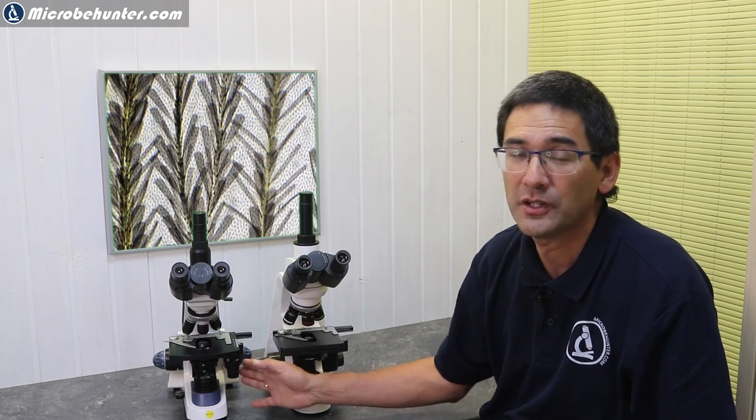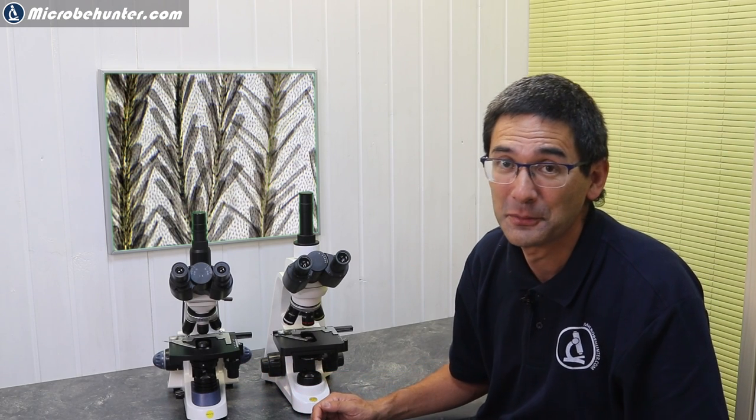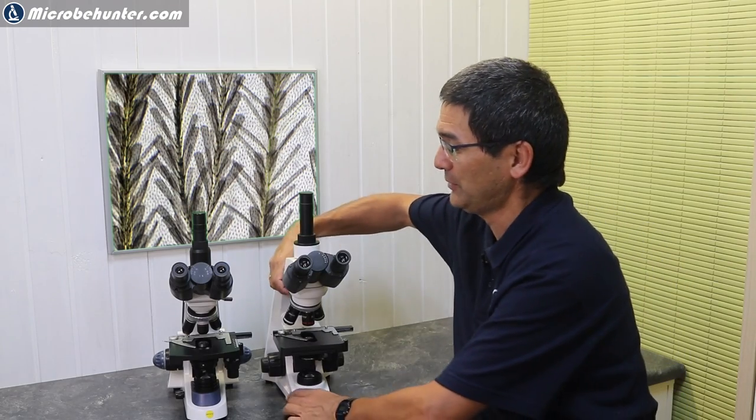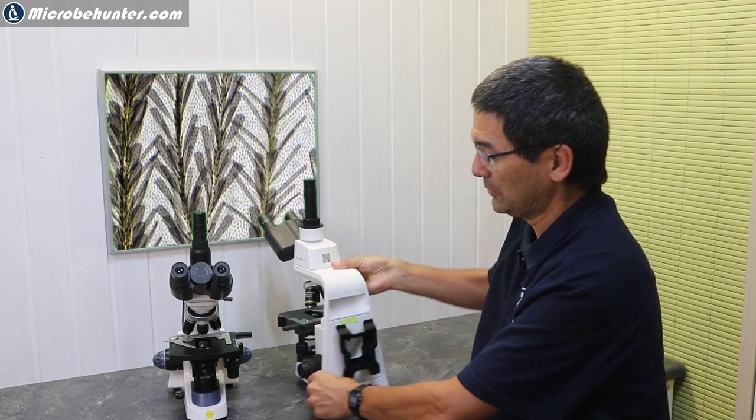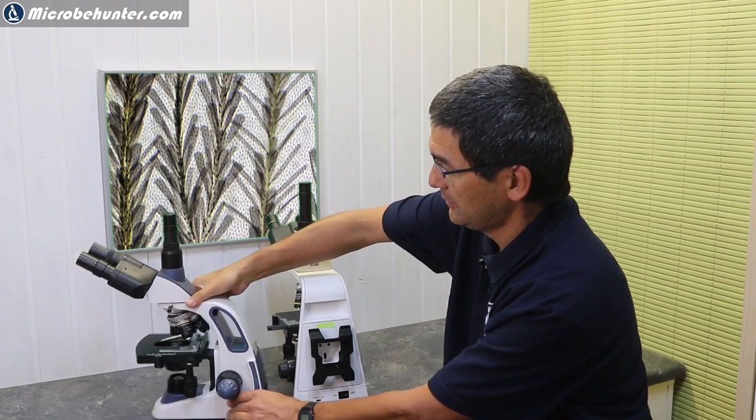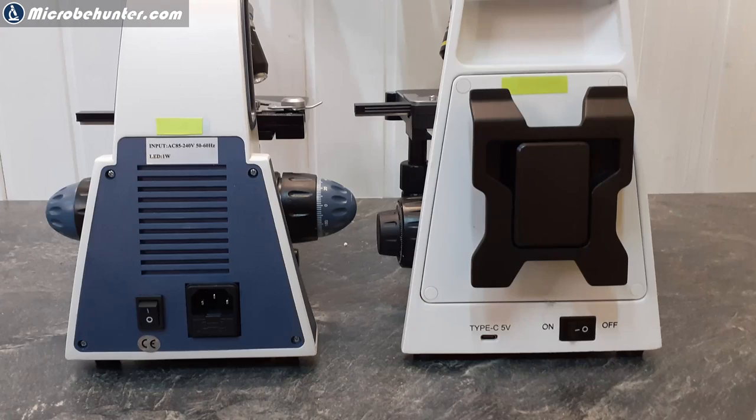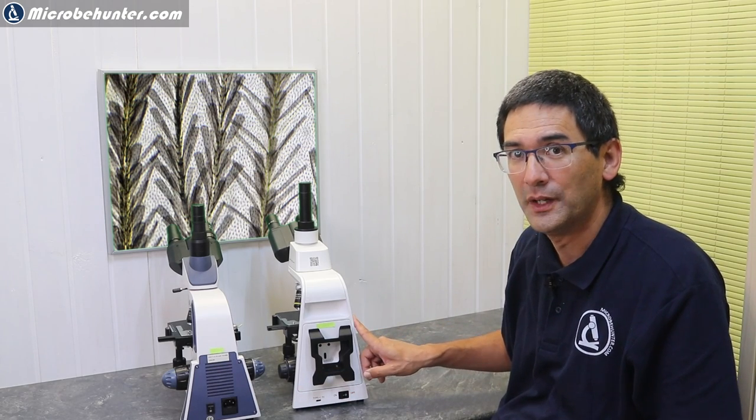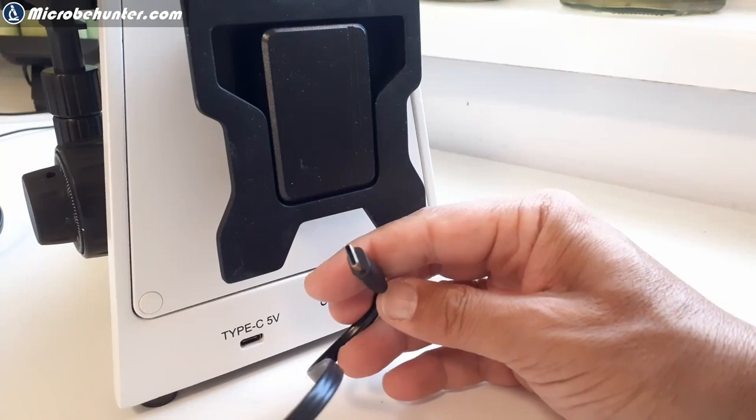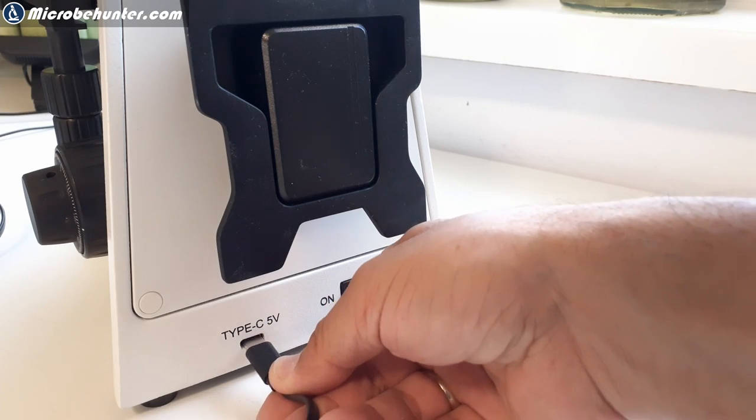Also concerning the mechanical stage, it actually looks pretty similar, both of them. The big difference, however, is the way that those microscopes are powered. When you turn the microscopes around you can actually see that the 380T here is directly powered from a power source, and the Stellar One has a USB-C connector here.